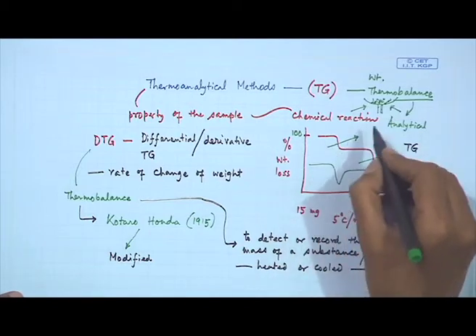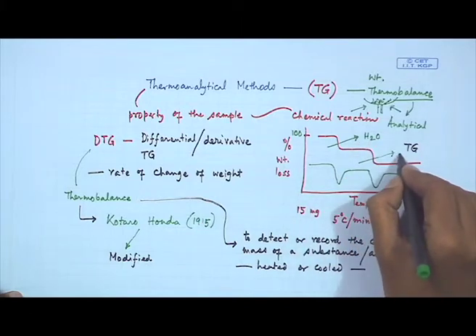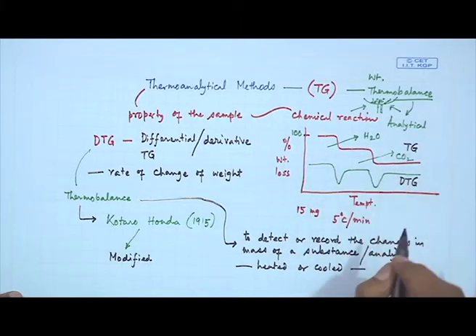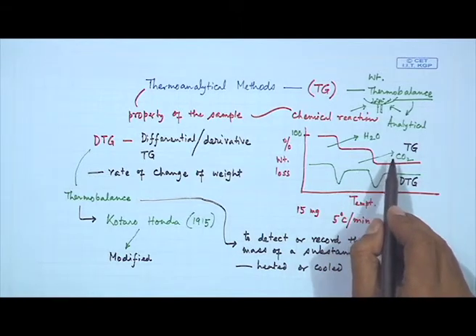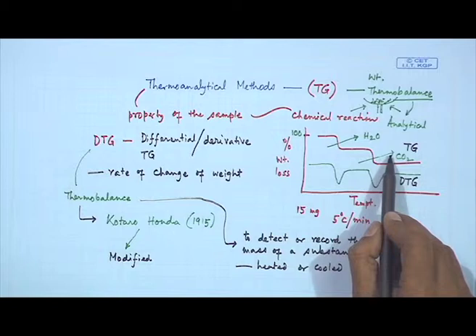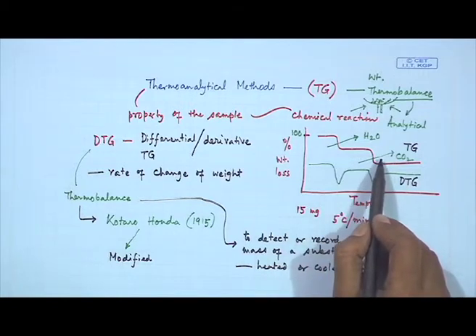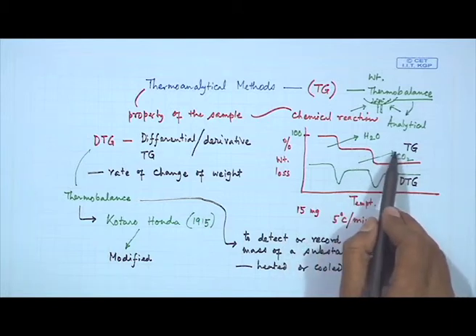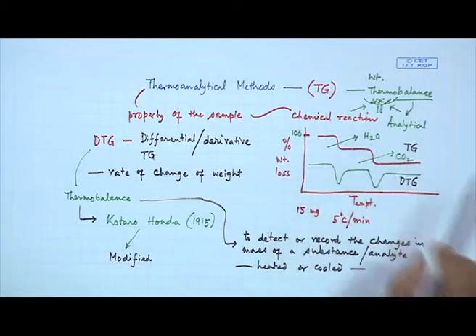That means if moisture or water vapor is going out, or some gaseous product is going out from the decomposition of carbonate salts like calcium carbonate or magnesium carbonate, we will take specific examples of the temperature at which that decomposition can take place. It can be any other organic solid also; that pyrolysis reaction we call it, and organic compounds, we all know, can burn.